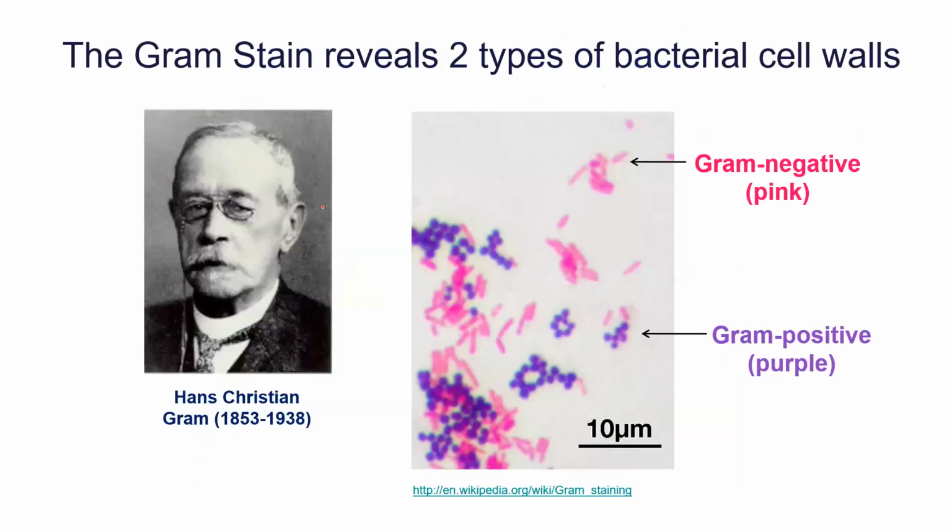One type of stain we are going to do in lab 4 is something called a Gram stain. The Gram stain was named after this guy, Hans Christian Gram, and he was looking at bacteria. This is a really important stain, both historically and still used today in modern science and medicine quite regularly. What it does is distinguish 2 different types of bacteria, and we call them gram negative and gram positive.